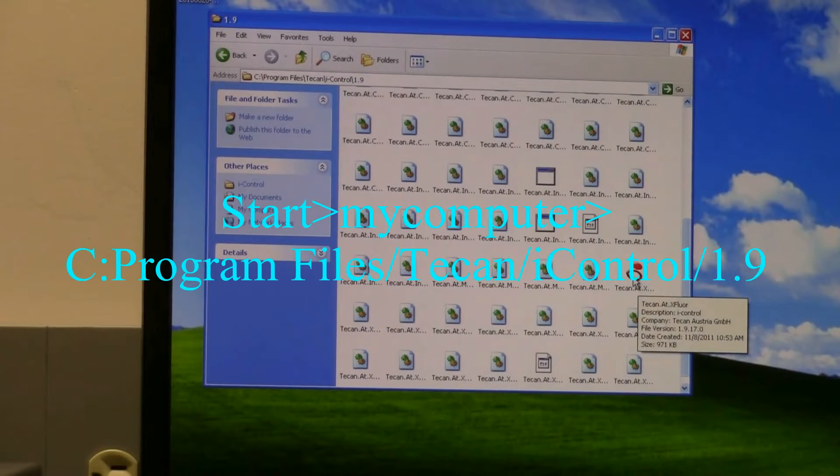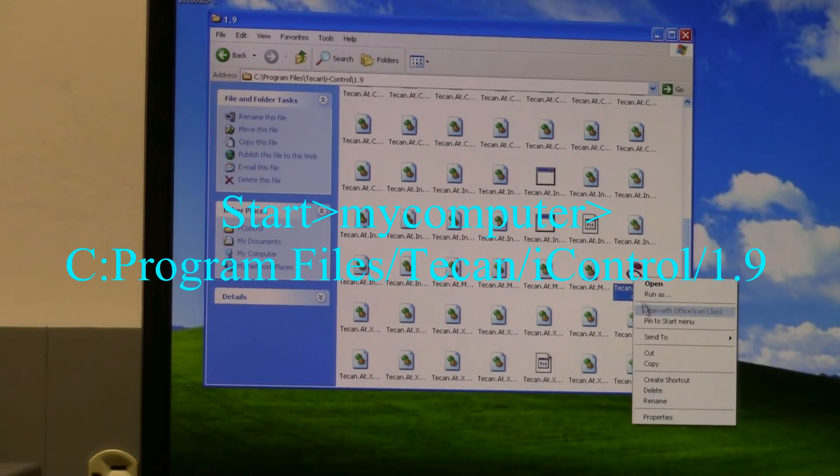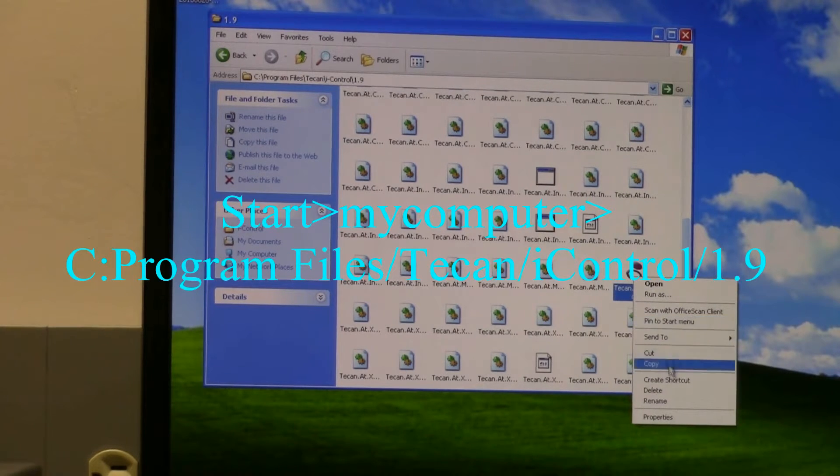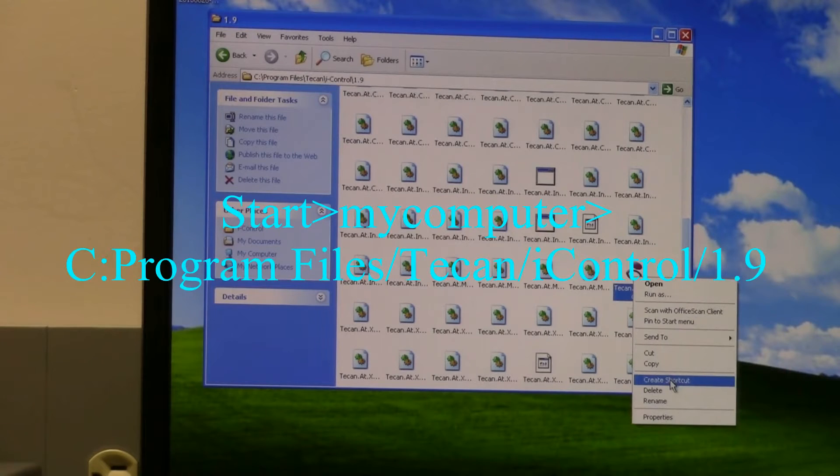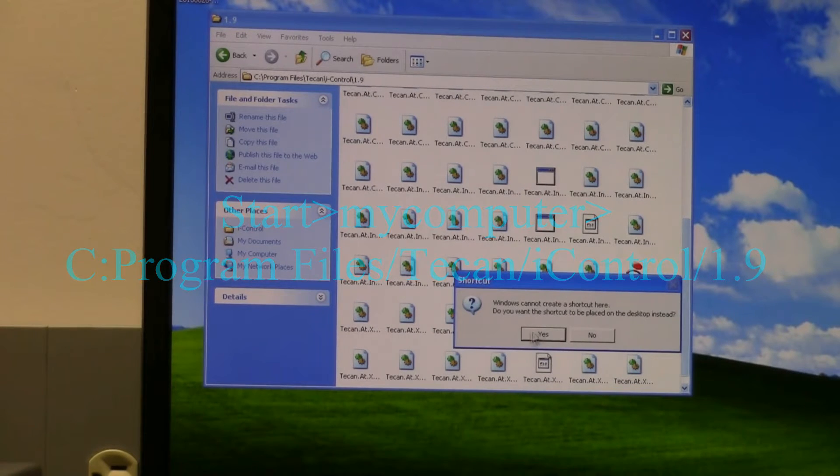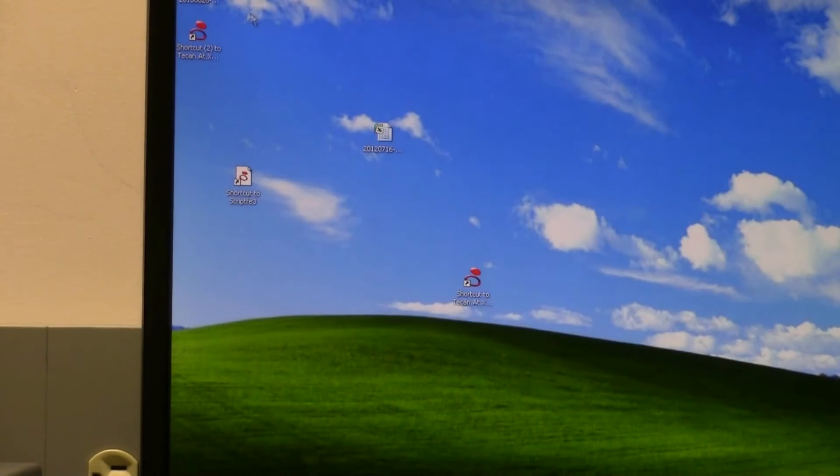Then you right-click on it and you say create shortcut, and then just say yes. Now it will have created a shortcut on your desktop.